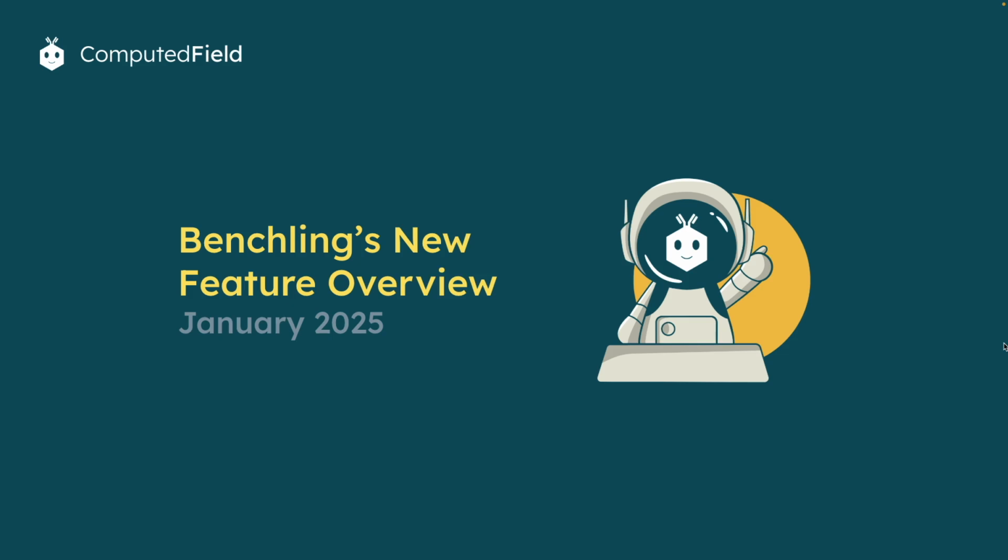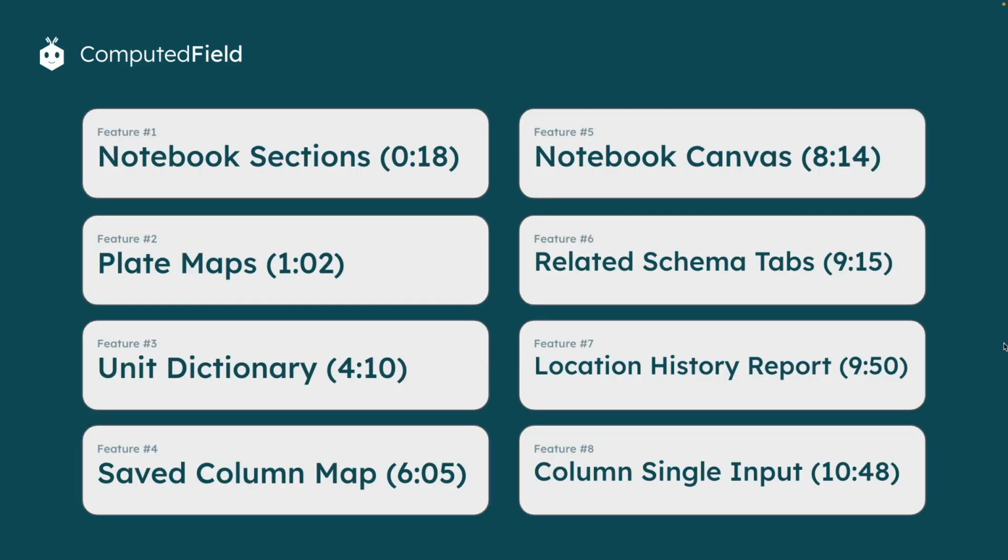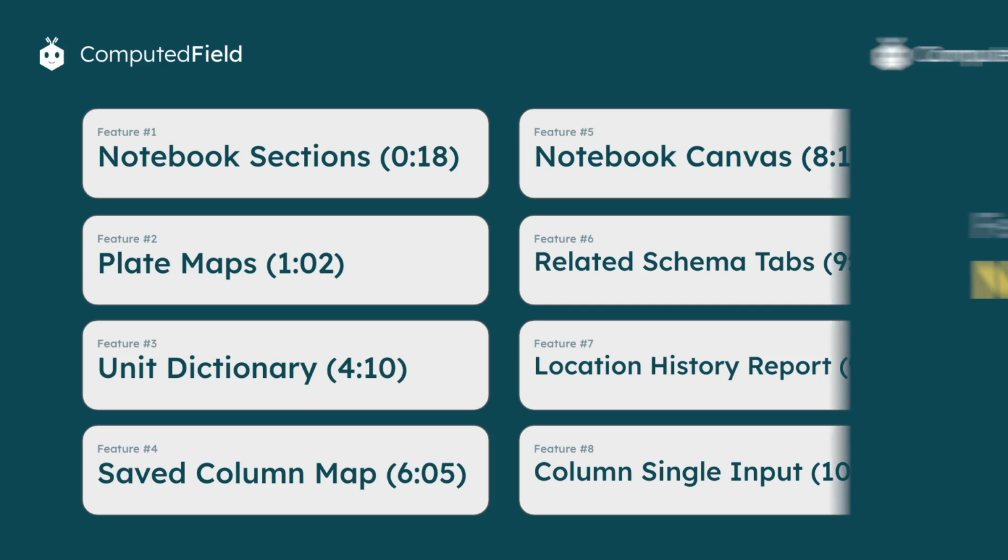We've taken the feature releases from the last 3 or 4 months and collated them into one video. You'll see throughout this video 8 different features. On your screen now, you'll see at which point in the video we overview them, so please feel free to skip ahead to the features that interest you.